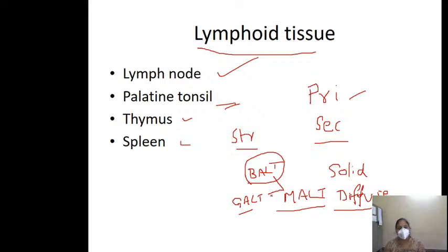An example for mucosa associated lymphoid tissue is the palatine tonsil. So how to differentiate these four slides? These all share similar structures, but whenever I see students writing in the examination, you are confused in differentiating these structures. Basically, that is the cortex and medulla.